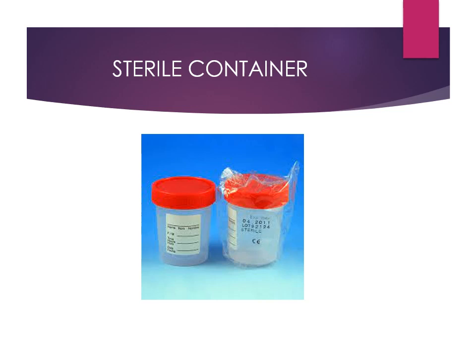If you are talking about the stool sample, they can ask you how you can process the stool sample, what media you can use for processing it, and how you process it if the sample comes to you. So you can tell about the stool examination, the macroscopic examination, and the microscopic examination. You are making the mounts, like the saline mount and iodine mount. Then they can go to the various parasites which you can see when you do the stool examination.